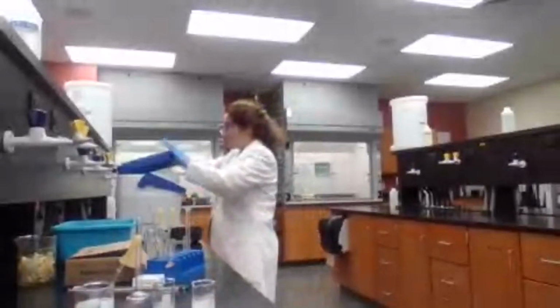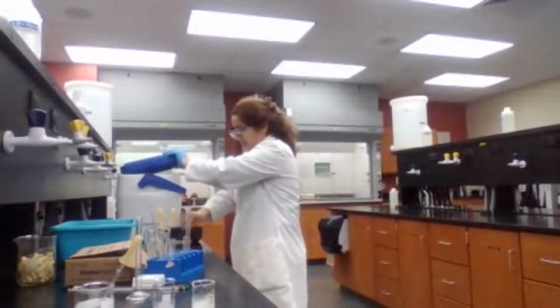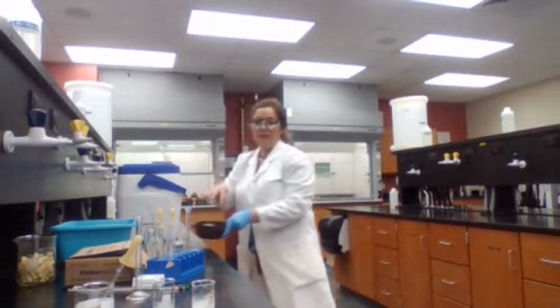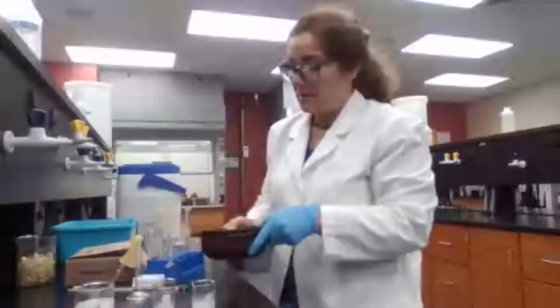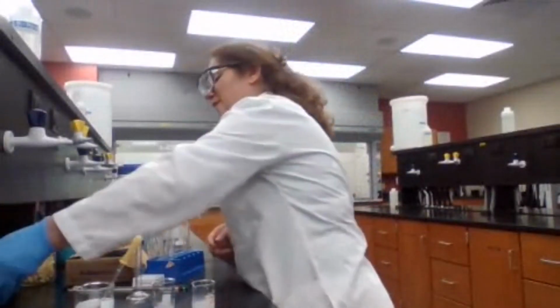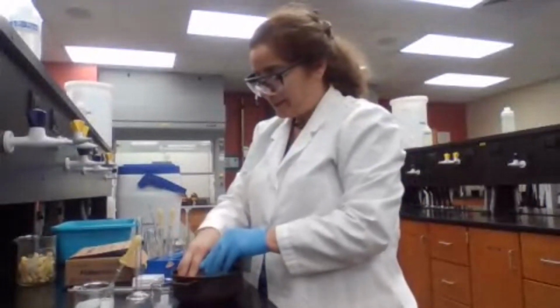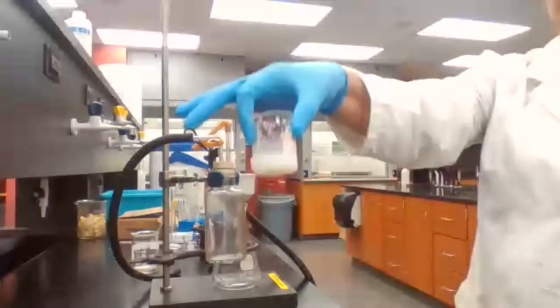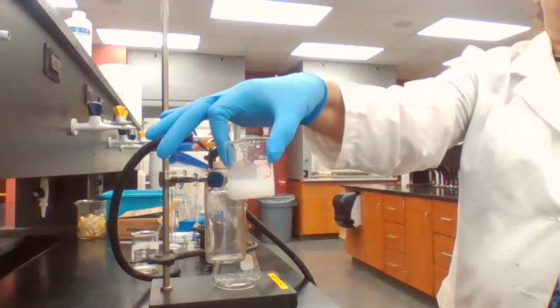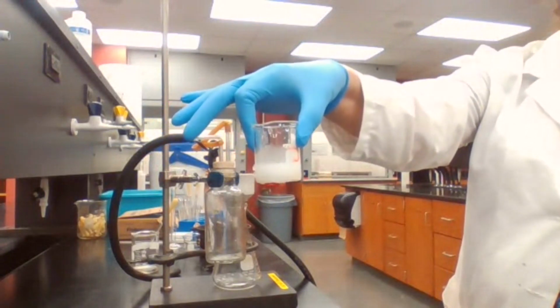Prepare the vacuum filtration. You remember the vacuum filtration setup? I have to use the vacuum pump and a vacuum flask. Screenshot of this product after putting it over the ice.